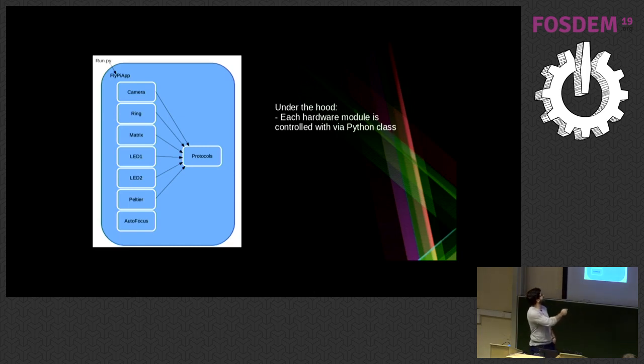Right, and then what you can also do is run protocols, meaning you can tell the device to run things automated for some time. So for instance, please turn on LED 1 for 500 milliseconds, turn it off, then wait another 2 seconds, and then turn it on again and repeat this 10 times. So you can actually run automated experimental protocols.